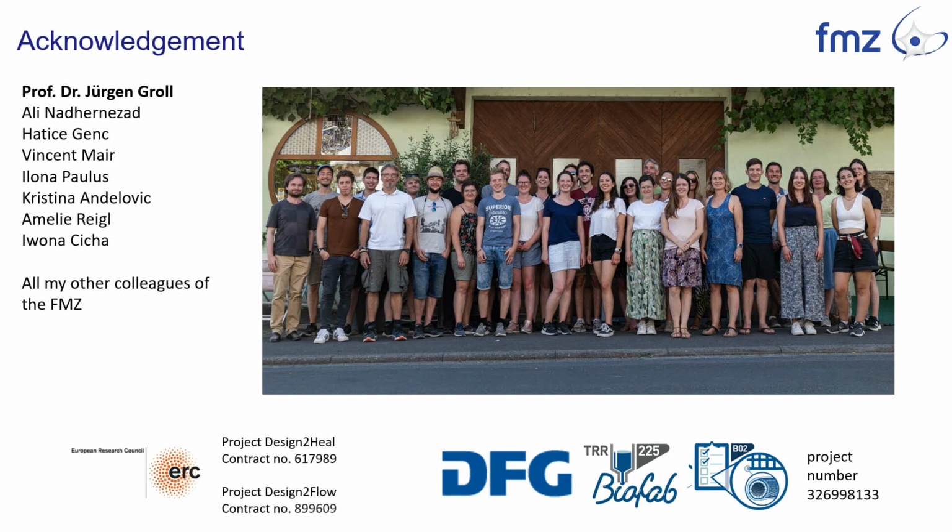Right, thank you very much for the interesting talk. I think you briefly talked about the compatibility of the hydrogel material with this process. So could you maybe remind or comment on whether it is compatible with common materials like collagen, Matrigel? I think you briefly mentioned, maybe I missed it.